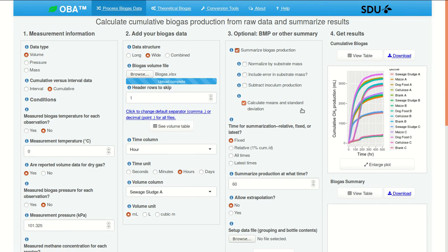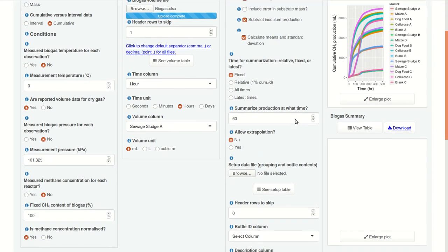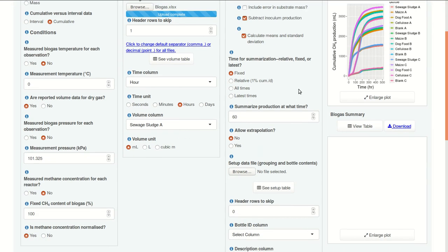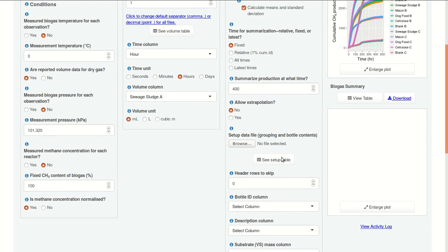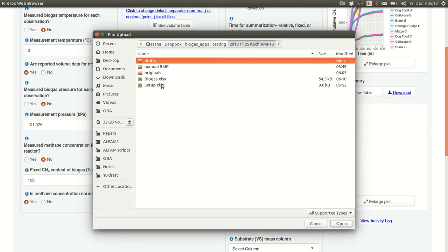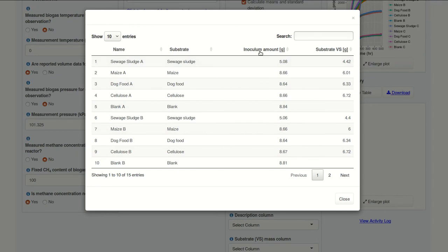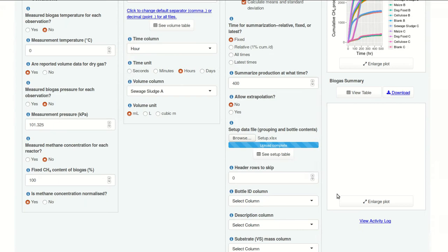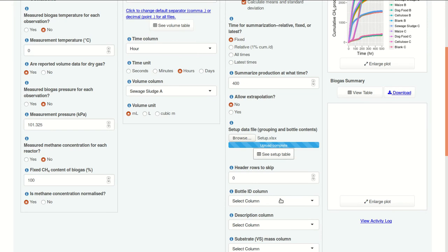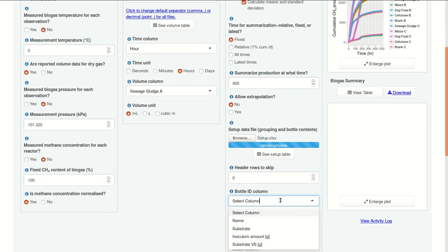We want to normalize by substrate mass and subtract inoculant production. And we'll start out with the default option of calculating means and standard deviation. What time should we use? We could enter a time manually. Say, 400 hours. We don't need extrapolation. But we have to upload our setup file. Let's take a look here. There's no extra header row. So, we don't need to skip anything.